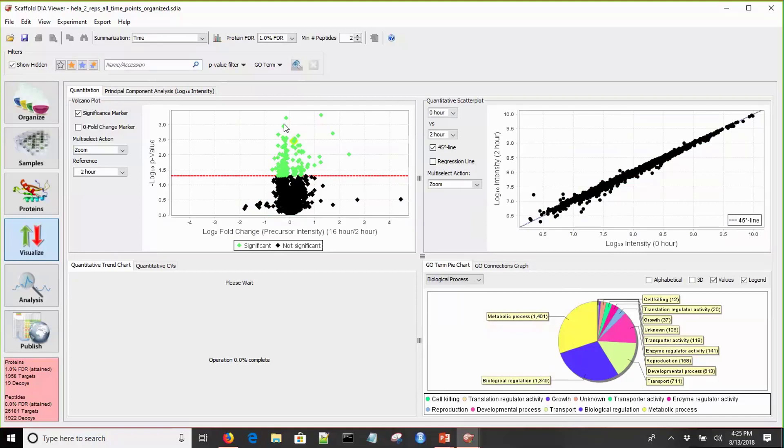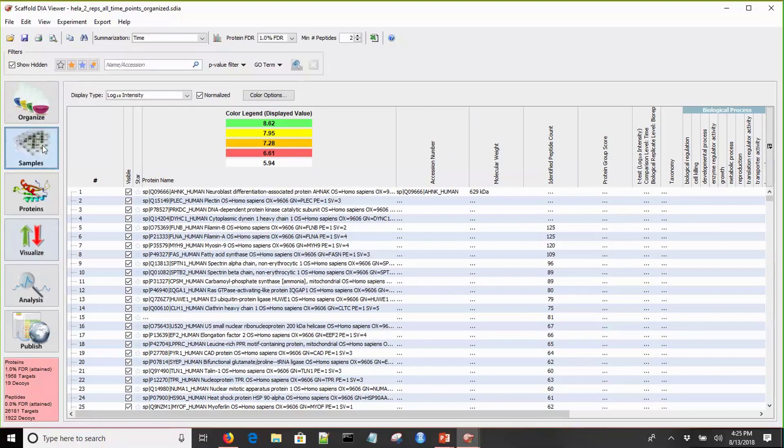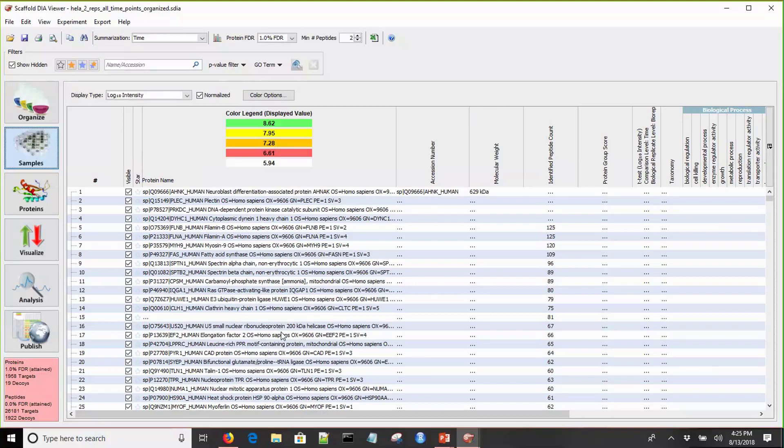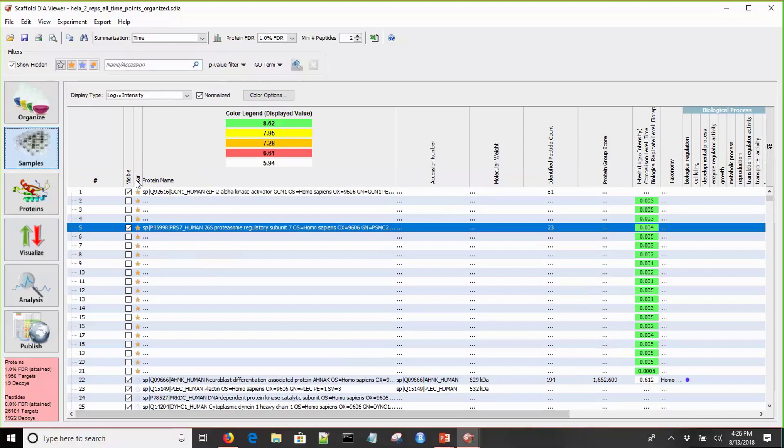Let's use one of the features we have. All of the charts are interactive. What we can do is, instead of just looking at it, we can change the multi-select action and we can add some orange stars. Click and drag over a portion. Now we've starred all of those proteins of interest. Remember, all of these proteins have significant differential expression, so these are ones that we should probably follow up on. Now let's return to the samples view. What I can do is sort on the stars and pull only the ones that are starred out, and we know we need to follow up on those further.